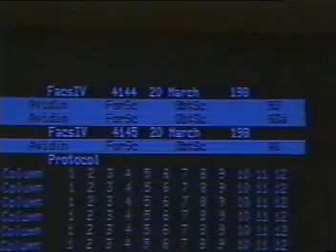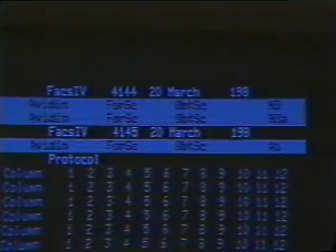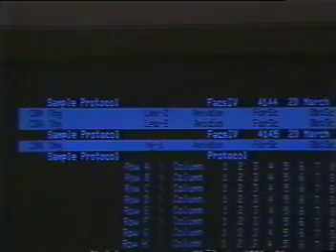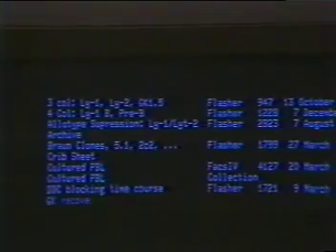When you are collecting data, it's a good idea to checkpoint every once in a while by pressing Enter C. Until you checkpoint, your data is not permanently recorded. Hence, if there is a power outage or some other problem with the system, you could lose valuable data.